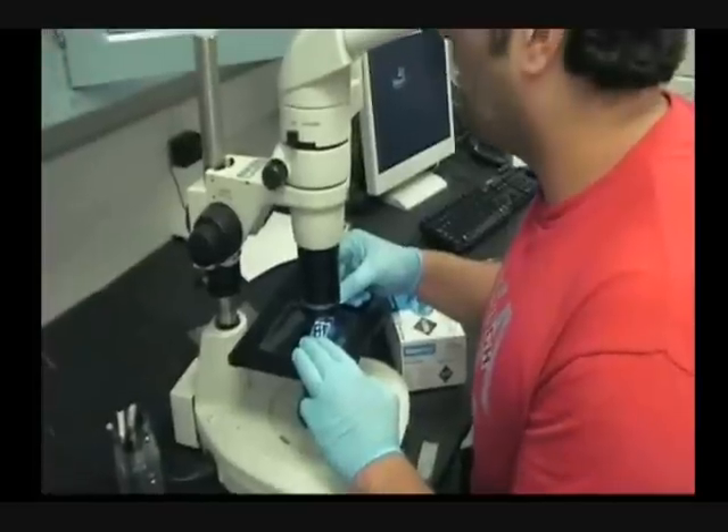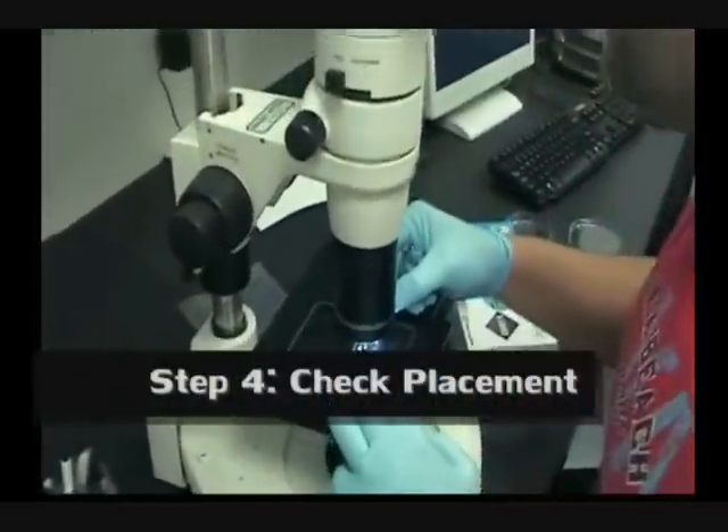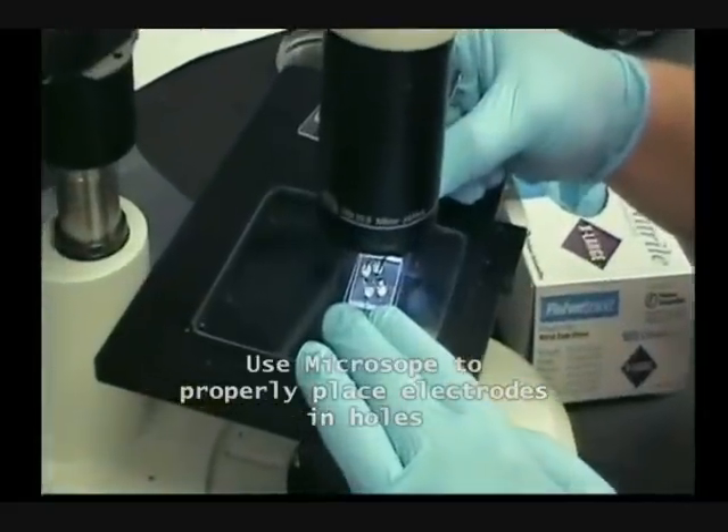Now I am gonna do the rest under the microscope. Now I am installing the electrodes, putting them into their openings under the microscope.